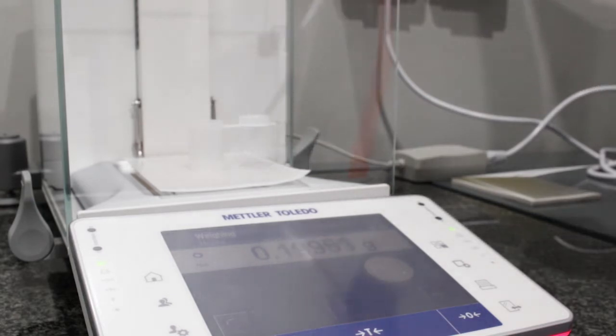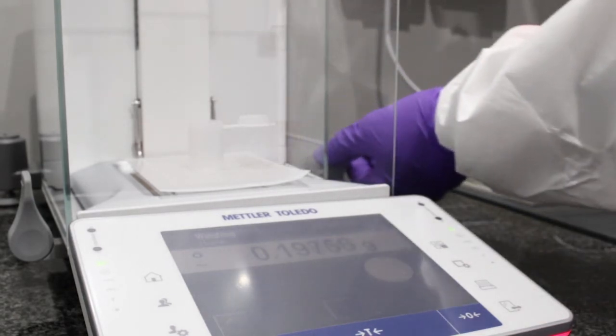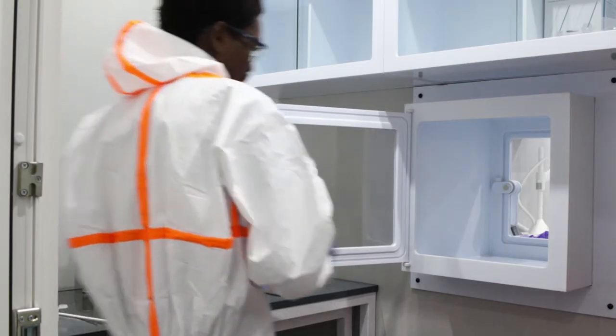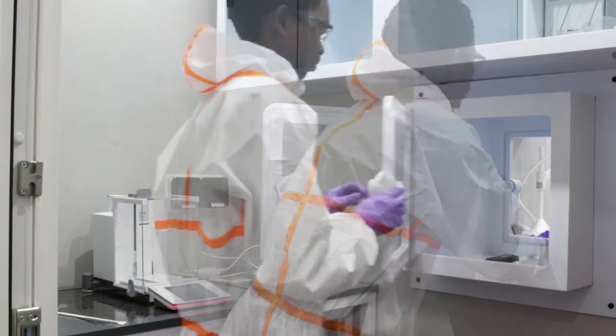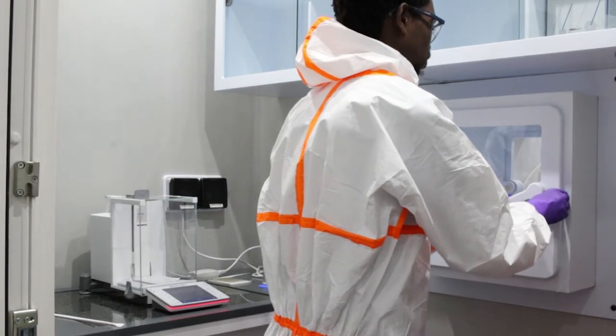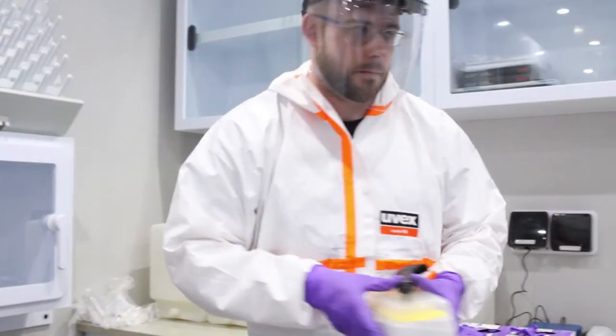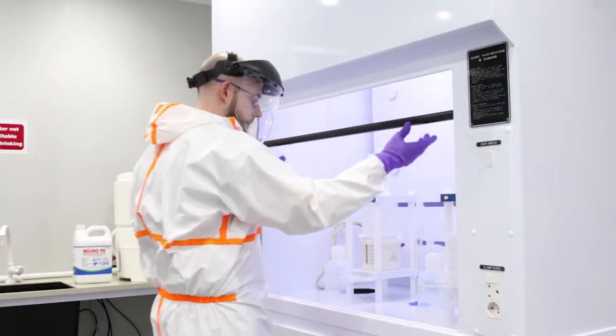So this lab really has to be ultra clean and metal free because we use acids and very harsh reagents to dissolve rocks and fossils and other earth materials. So we want to make sure that we don't have any other contamination from the environment in the lab.